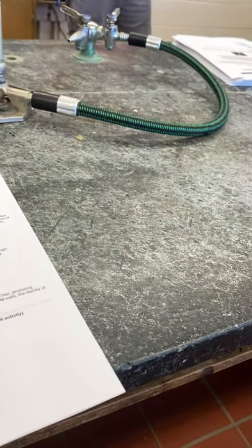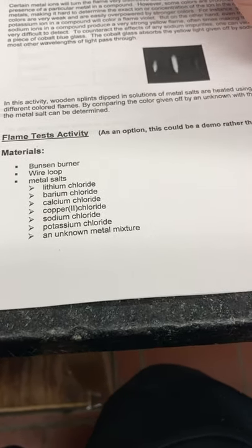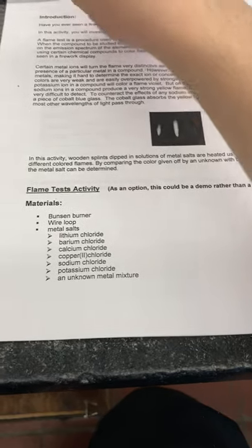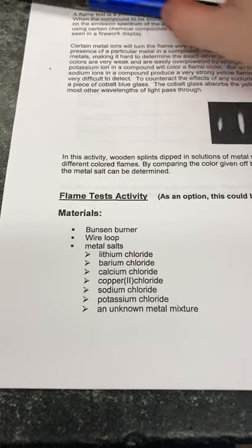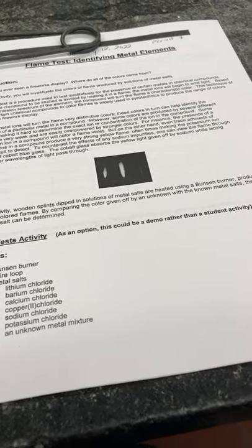Alright, let's stop with our clickers for a moment. Have you ever seen a fireworks display? Where do all the colors come from? In this activity, you will investigate the colors of flame produced by solutions of metal salts. All the materials in front of you are different types of salts. Since there was a lab before you, things got mixed up, so the main color we're looking for might be a little blended. We'll see how that goes.